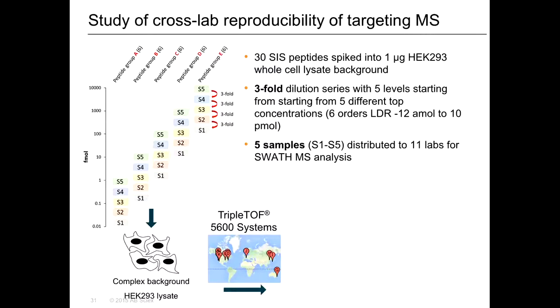They used the same acquisition machine, a TripleTOF mass spectrometer, and they agreed on acquisition windows, but everything else was basically left to them, like exactly what column they used, what pump they used, and so on. So we did not try to specify too much, but to basically say, are we able, in a realistic experimental situation, where different laboratories acquire data from a sample, to acquire results that are comparable?